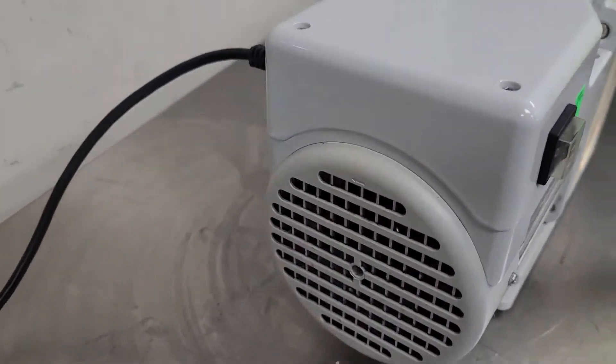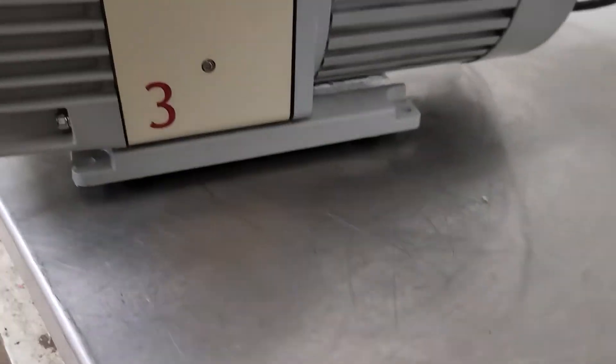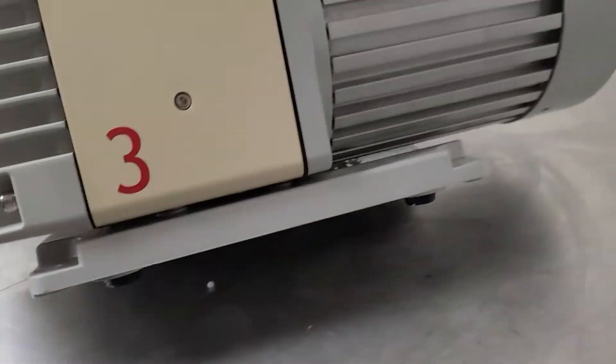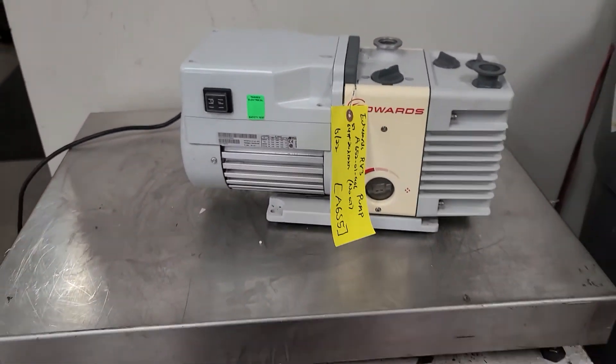I'll give you a quick little walk around here. Back side. Bottom. Got all its feet. Nice little unit. If you've got any questions, let me know. Thank you.